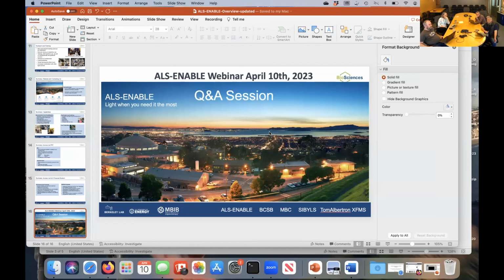You can always get a little bit more. Sometimes it will really help, where you gain a half angstrom or find out it's the wrong space group or unit cell. So anywhere you get an automated data processing result, go through it again.